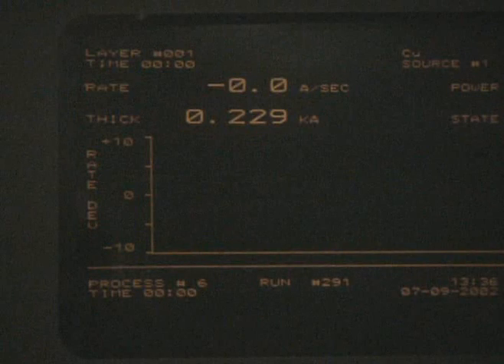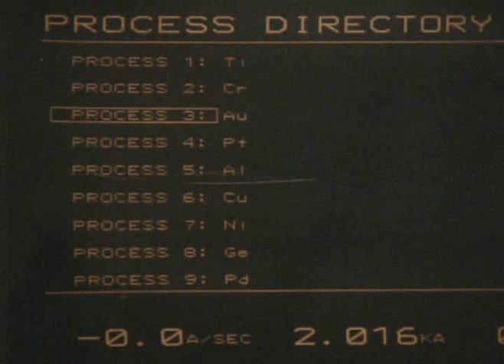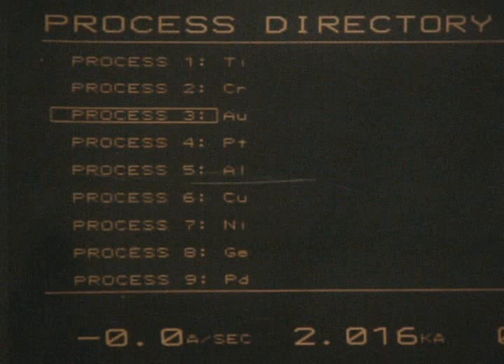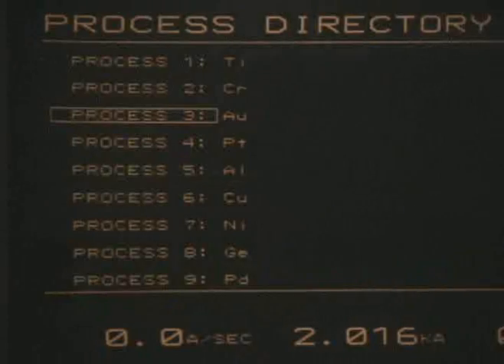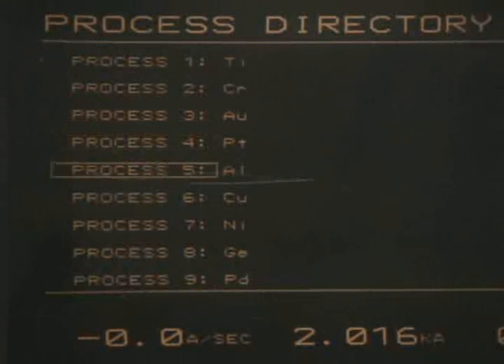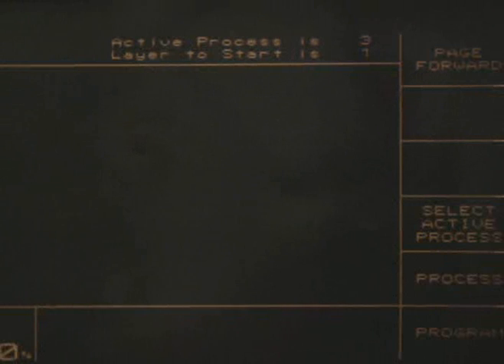The first thing we want to do is go to the program page by pressing F6. Then go to the process directory by pressing F2. From this page, you can select the metal you want to use. In our case, we are using copper, so we will use the arrow keys to select it. If you look at the top right-hand corner, you see that the current metal is 3. Now press F4 to select the active metal. The indicator will change to 6 to show that we are using copper.